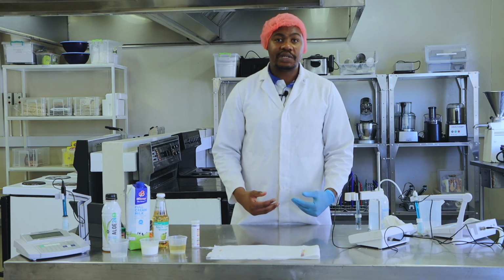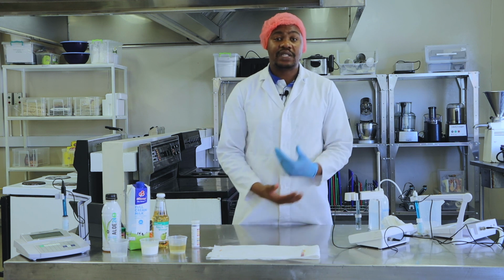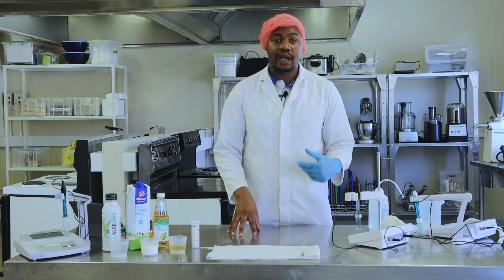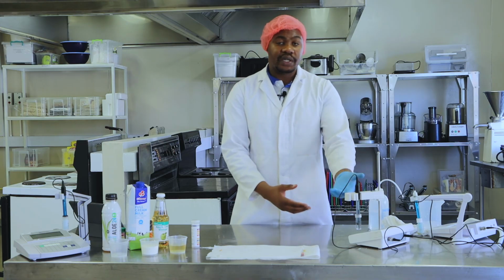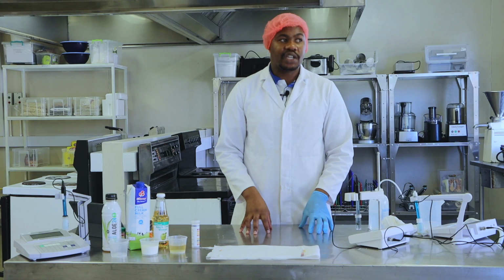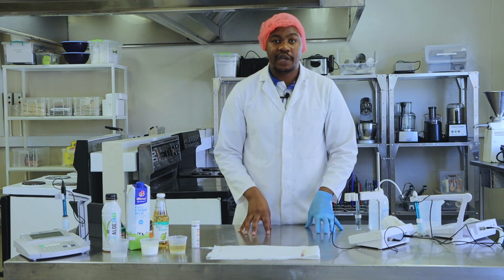The answer is very simple. Firstly, if you've got a solid material, you must crush it, or for example, add distilled water to give it that liquid flow, and then from there you can insert a probe. But you cannot really measure the pH of a solid potato using these types of pH meters.